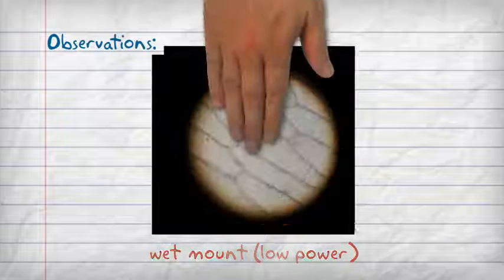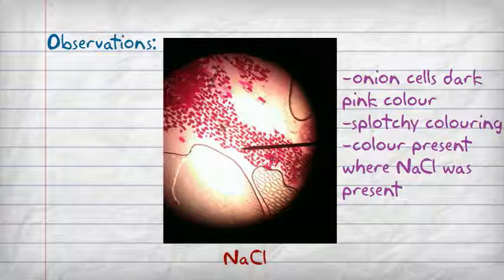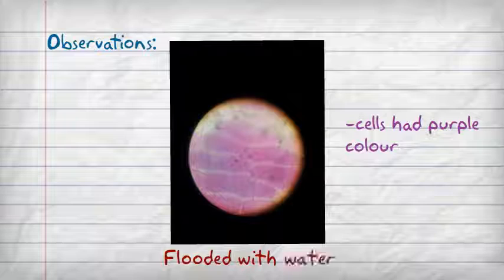Observations: wet mount with low power, wet mount with high power. Sodium chloride. Flooded with distilled water.